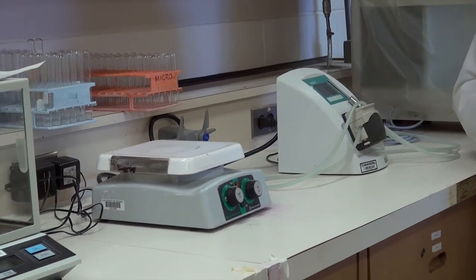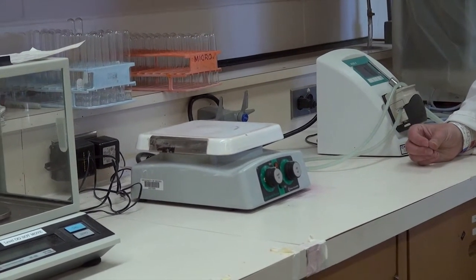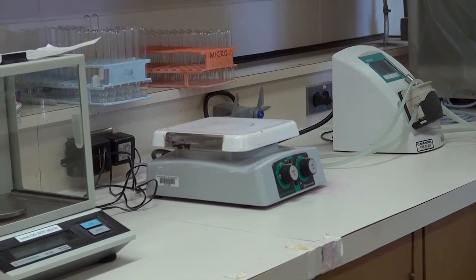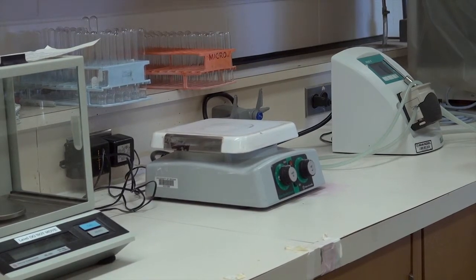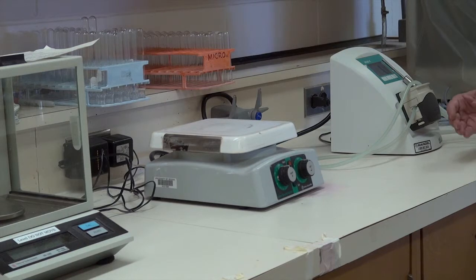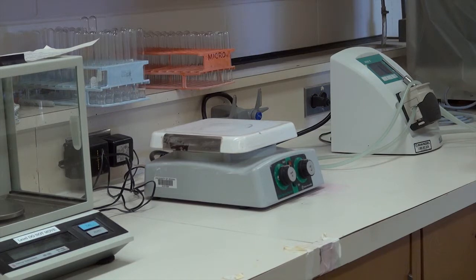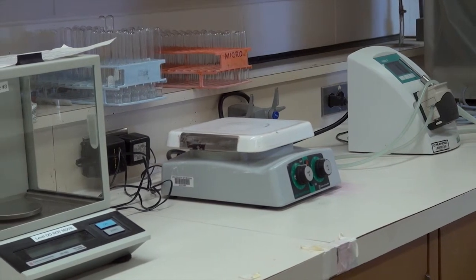The next item is a heat and stir plate. So what it does is it stirs up solutions for me and it makes the solutions homogenous very quickly. And it also can heat the solution up, which is absolutely necessary when I'm heating up solutions that cannot be sterilized in the autoclave.